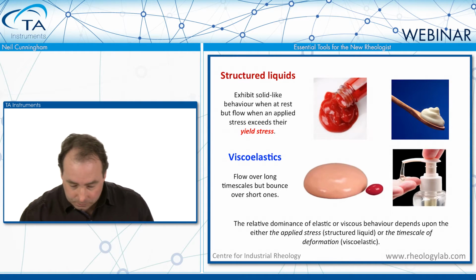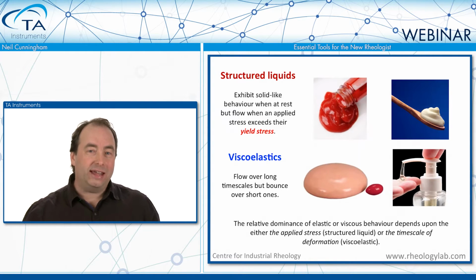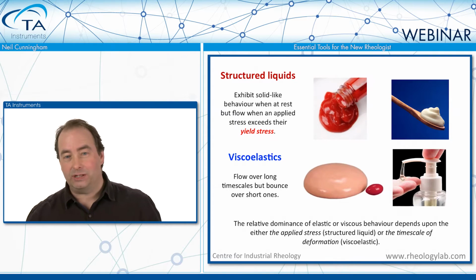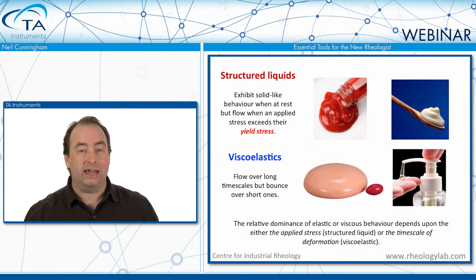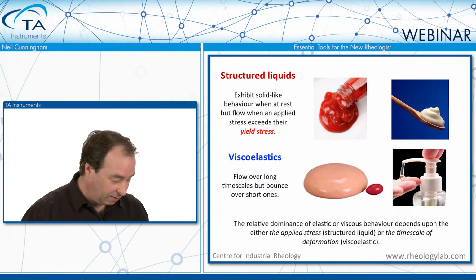Okay, so what we then need is a way of identifying whether our particular material is exhibiting, under any certain circumstances, an elastic behavior or a viscous behavior, so a solid-like or a liquid-like behavior.